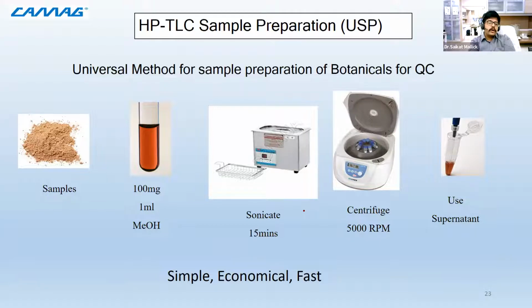So preparing a sample for antioxidant activity can be a very important aspect. You can choose a wise solvent for preparing your sample. Normally for qualitative and quantitative estimations, methanol is preferred over other solvents because most substances get dissolved in methanol as compared to other solvents.